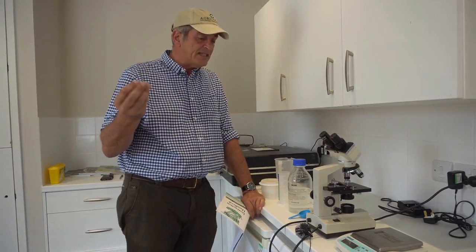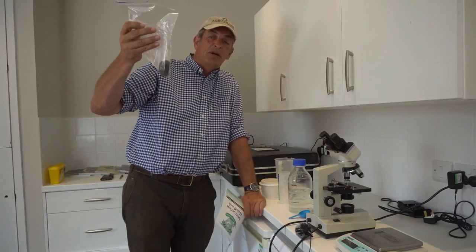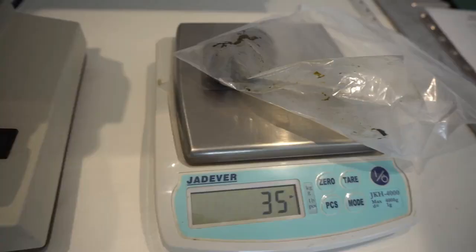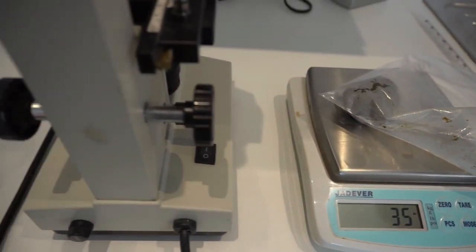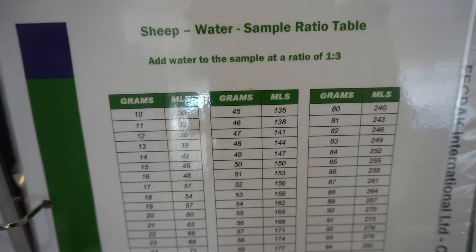The basis of it is that you collect fresh lamb or sheep poo — this is still warm, very nice and fresh. You just weigh it very carefully on a set of scales, and there's a simple guide that tells you how much water to add to that sample.